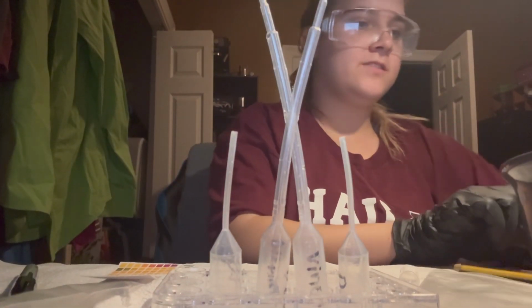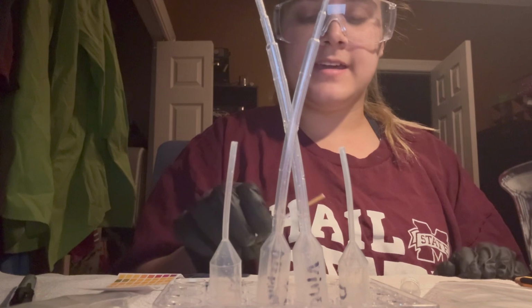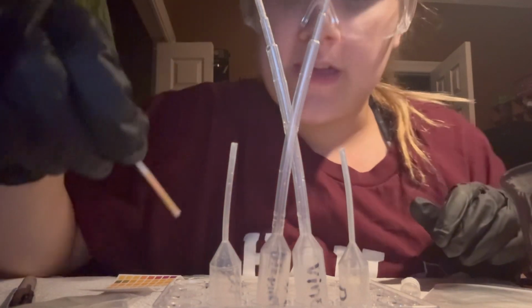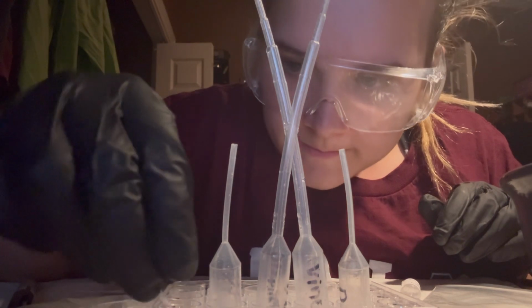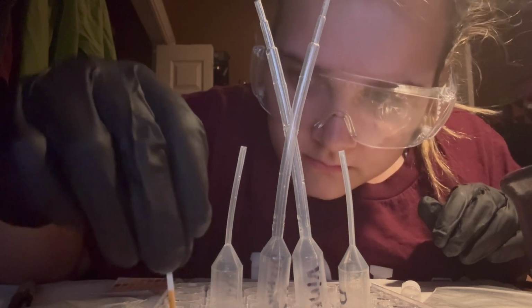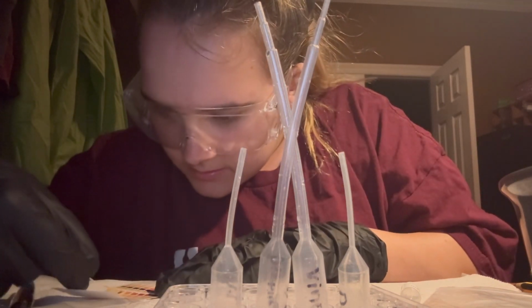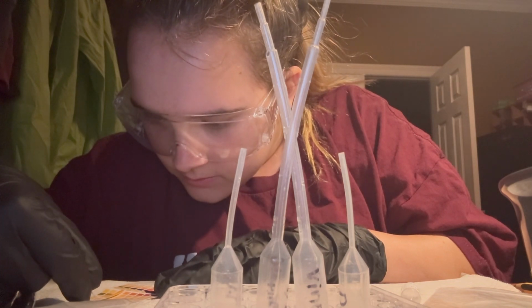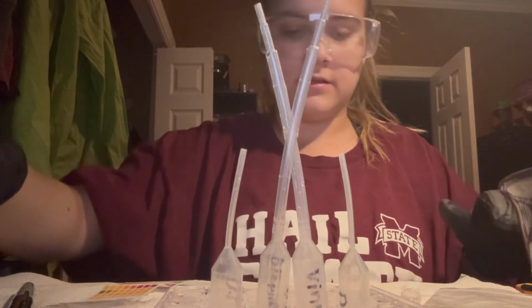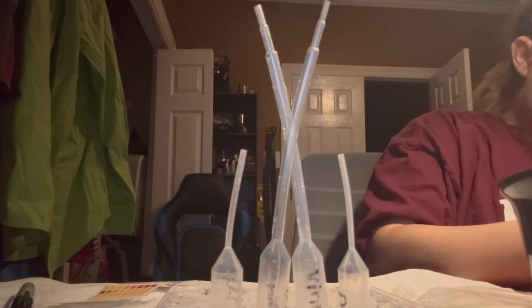Hello, so here are my results for data table 1. Now we will move on to the experiment for data table 2. It says measure the pH of the A6 well. So we will use this pH strip to measure the pH. The pH seems to be in the 4 range. So we'll put our pH for 0 drops as a pH of 4.